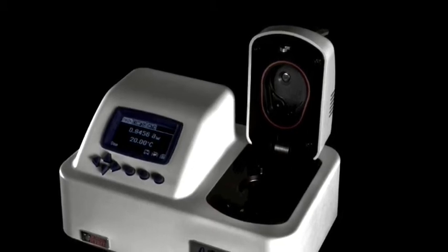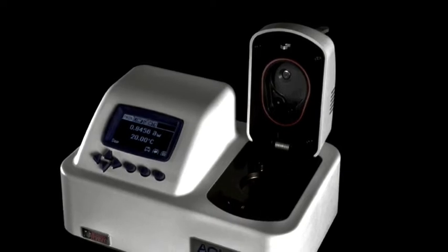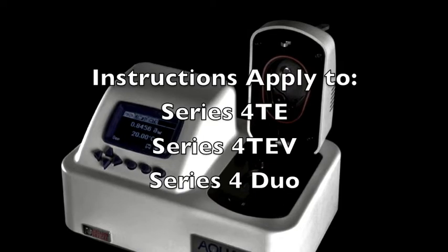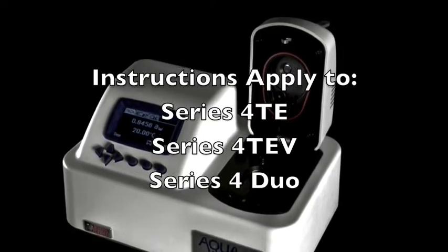What's more, the new Series 4's clamshell design makes cleaning easier than ever. Today's video features a Series 4 TE-V, but these instructions also apply to the Series 4 Duo and the Series 4 TE.